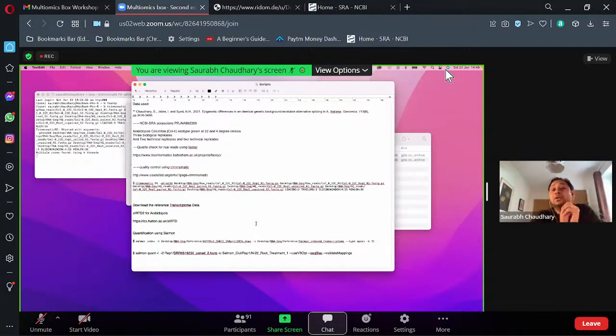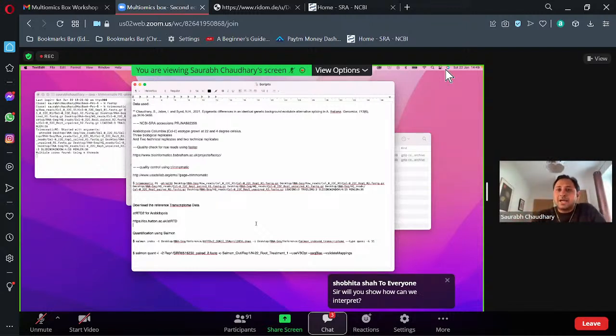It's just to give you the quantification file, which I am going to use tomorrow in RStudio. I will move those files. I will show you what those quantification files look like, how to transfer them into R, and in R, how to perform the differential gene expression analysis and other stuff with that pipeline, and how to interpret your results. So if you want to do these analyses, you have some RNA-seq data of your own, or you can download some and just try it. If you have any problem, you can ask me at any point. Okay.